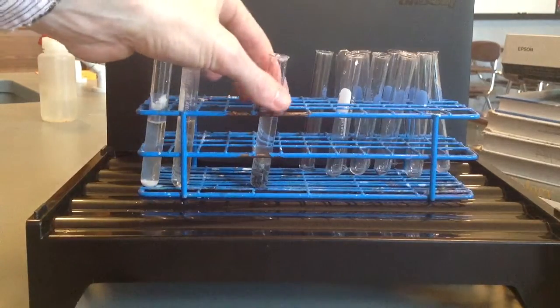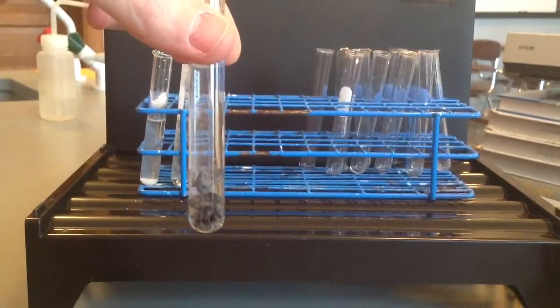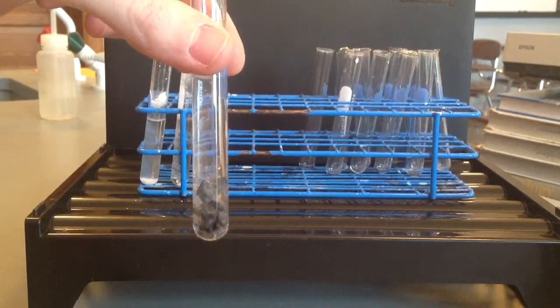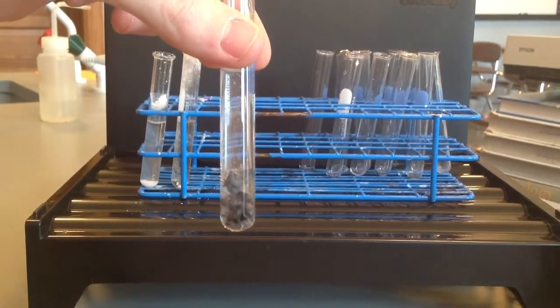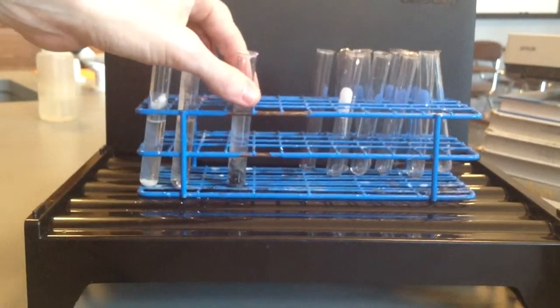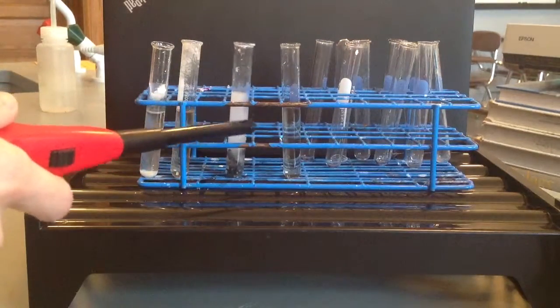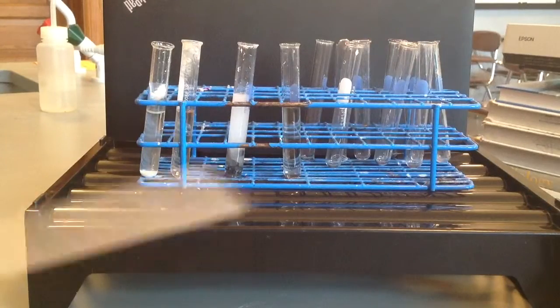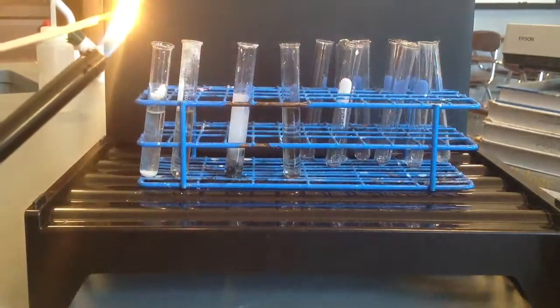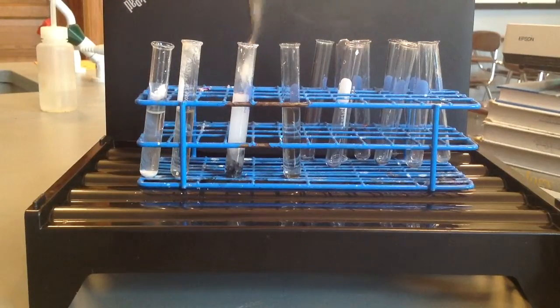Okay. Bring that a little bit closer to the camera so you can get a closer look. Okay, I'm going to put that right back in the test tube rack and let it sit there for a bit. Okay, so the zinc and the hydrochloric acid has been sitting for a little bit. I'm going to go ahead and do the burning splint test and see what happens. Alright, I don't know if you could hear it, but it kind of made a small little popping noise. It was really, really soft.